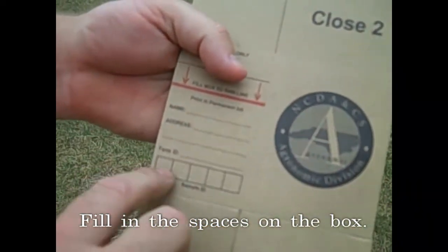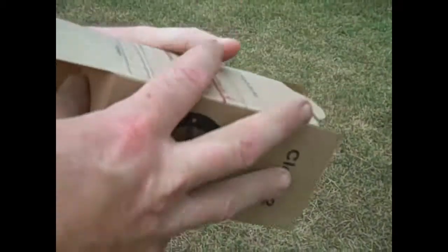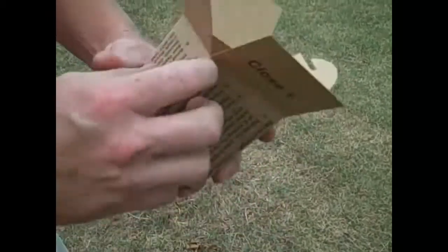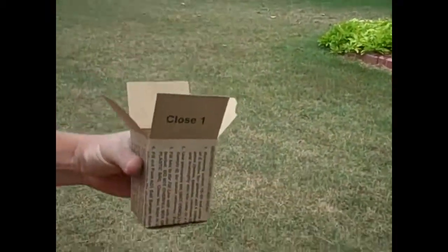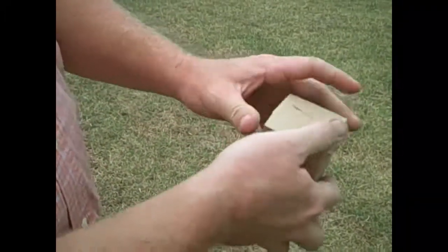Here's our box. Put your name, your address, and what you want to call that sample. In this particular instance we might call this one 'front' since it's the front yard. Then you fold the box up — it's pretty simple. You've got two flaps: close one, close two. You put your soil in and fill it up to the red line. You can go a little over it — that's fine. Then close your box up and that's ready to be sent in to the soils lab.